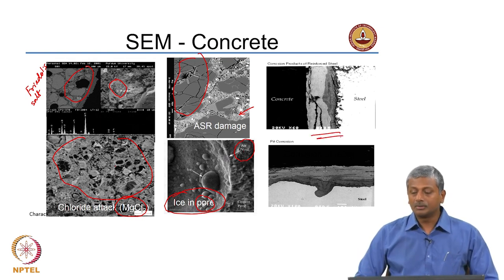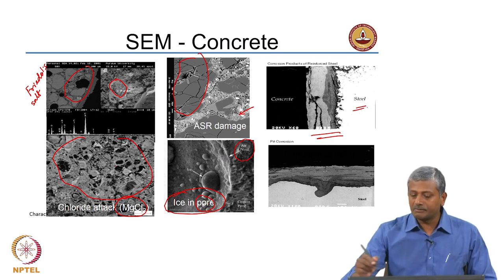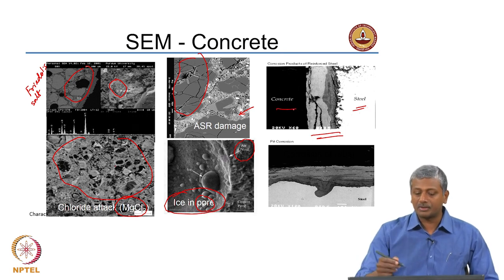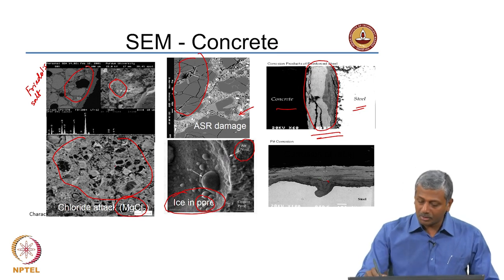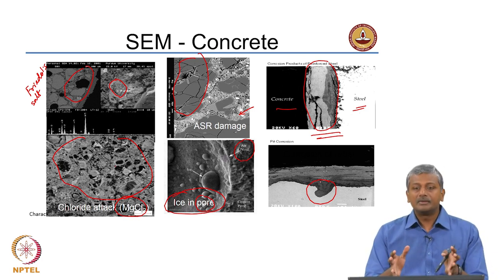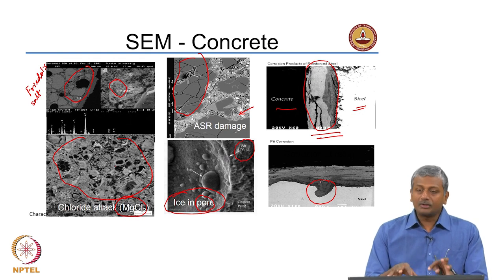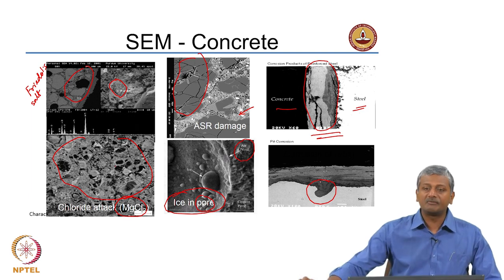Here is an image of corrosion of steel in reinforced concrete. When imaging a backscattered sample of a section at the steel-concrete interface, the steel appears extremely bright because it is much denser than concrete — so here concrete appears black. The rust products forming at the interface of the steel and concrete appear at different levels of grey. In the bottom picture, you can actually see the pit formed in the steel — that is basically an example of pitting corrosion. These images nicely show the nature of durability problems through the phase alterations that have happened inside the cementitious system.